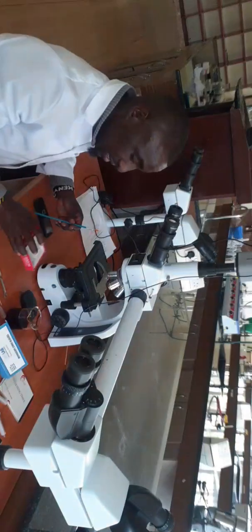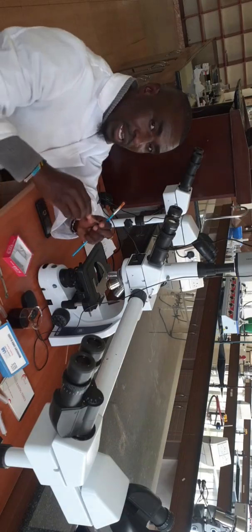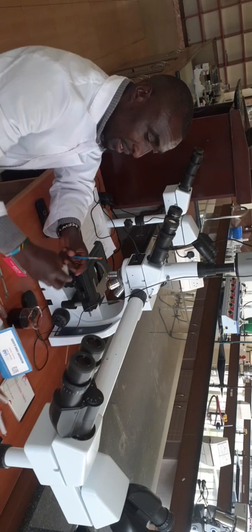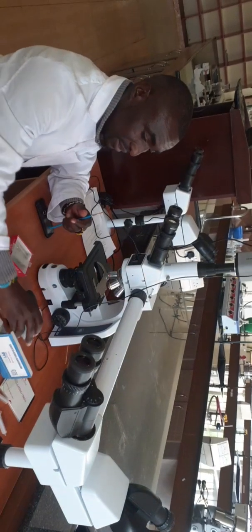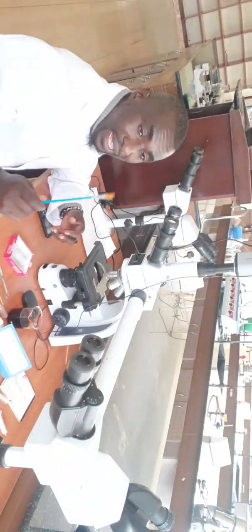This is a slide. This is how slides look like. Yeah, this is a slide. We have got the cover slips. There must be a cover slip. This is the cover slips. I've got the camel hairbrush.